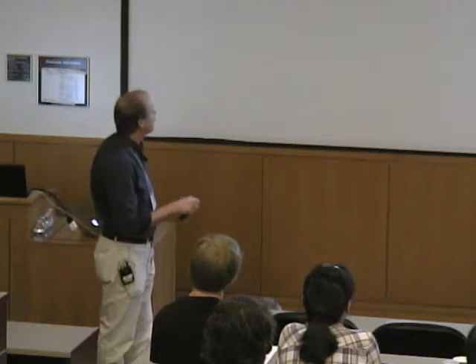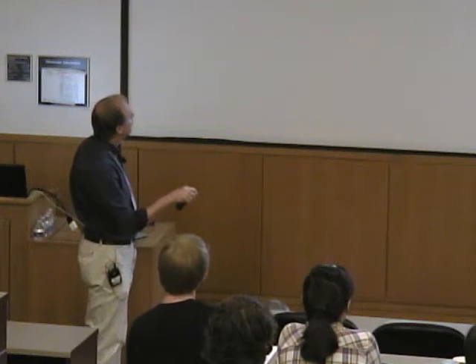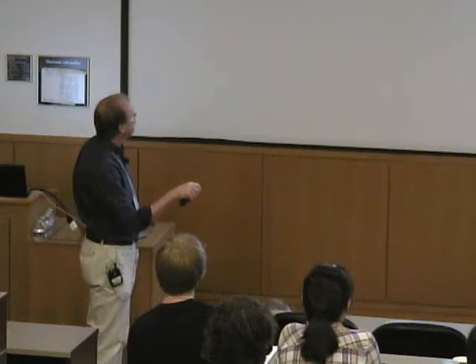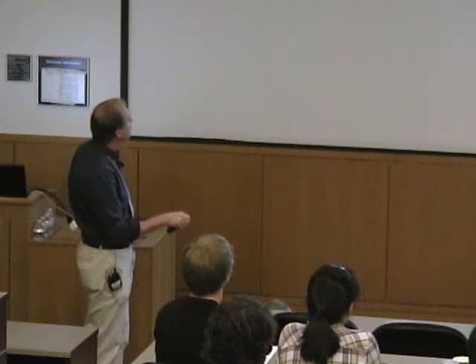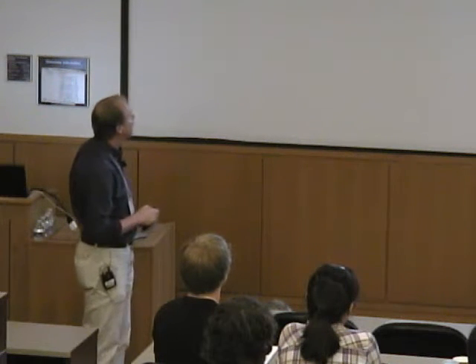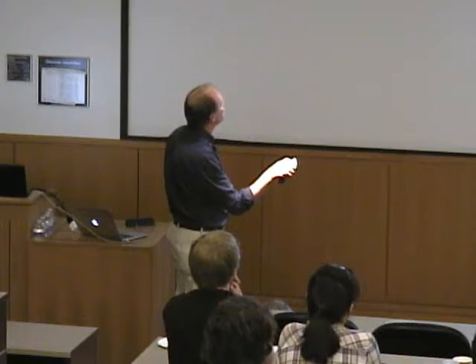So an example of this is an iron-sulfur cluster that was measured here in John Goldbeck's lab in a heliobacterium. And this is the spectrum they recorded. You can see we're at very low temperature here. They measured it at a series of temperatures, which I'll come back to in a second. But you can identify approximately, anyway, a couple of peaks in the spectrum. There's something clearly out here at an effective G value of 2. And then down at very low field, we have some transitions at higher G values. And looking at this, they estimated that this edge is at about 5.4, and there's a bit of a peak here at about 4.4, right?